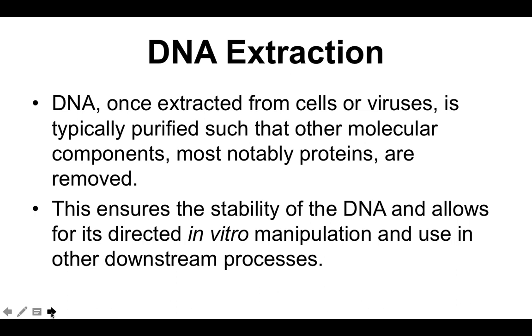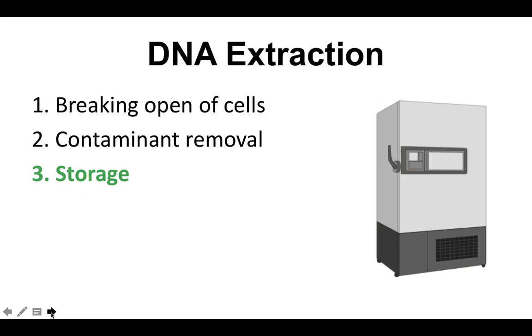It's very important that contaminant removal be done, because if we're going to use our extracted DNA for other downstream processes, or let's say if we want to do in vitro manipulation of that DNA, it is important that the DNA is stable. And stability of the DNA molecule can only be achieved if it is pure.